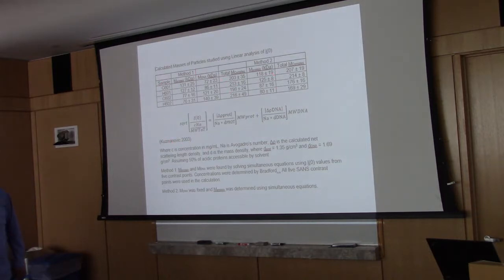Here, our collaborator Susan Kruger wrote just a simple algebraic program that basically takes all the data and solves a system of linear equations to derive molecular mass for a two-component system, protein and DNA, or in a case where you fix the DNA and just calculate the protein. And all around, you get figures now with the right concentrations. You get masses that are now very consistent with an octameric nucleosome, corroborating the other experimental measures that we made.